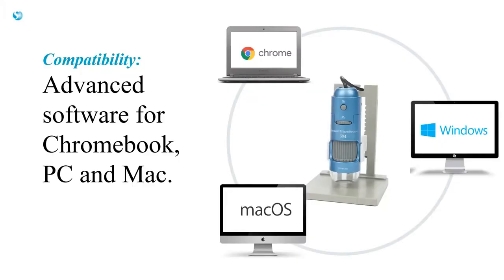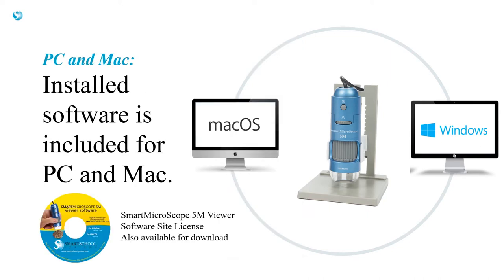The Smart Microscope 5M is compatible with Chromebook, PC, and Mac. On a PC or Mac, you can use the installed software. Every 5M comes with a software site license, so you can install it on every computer on your campus.